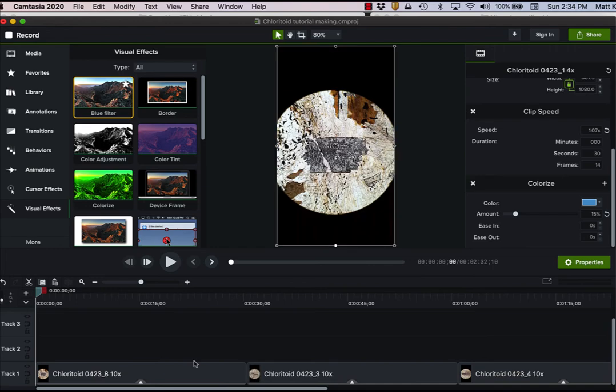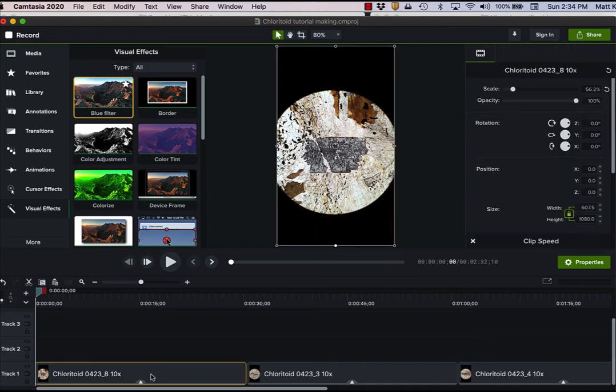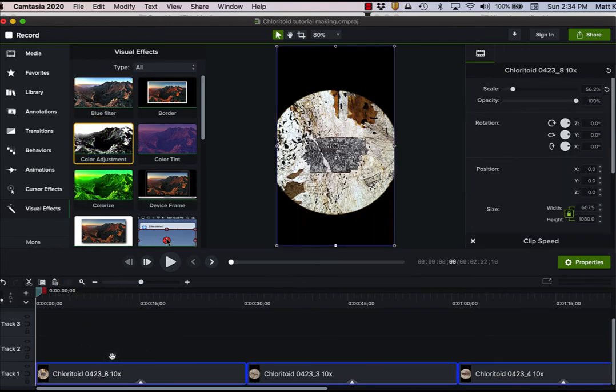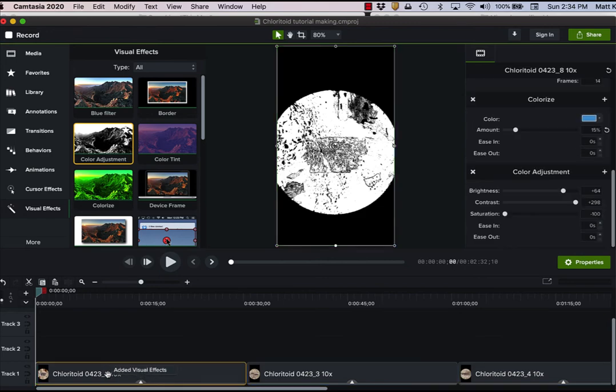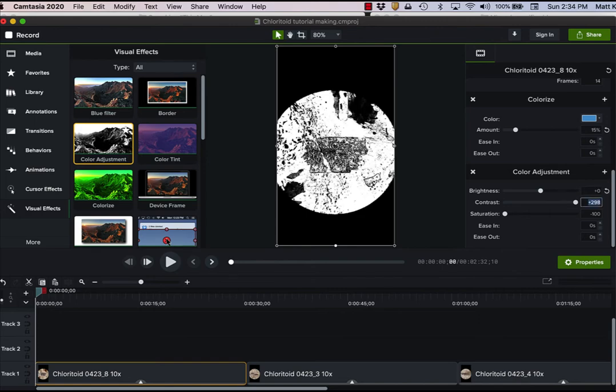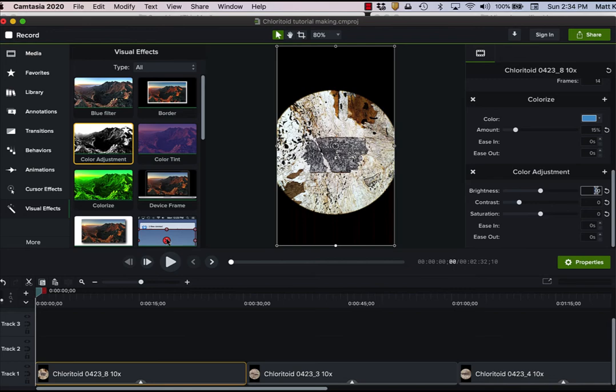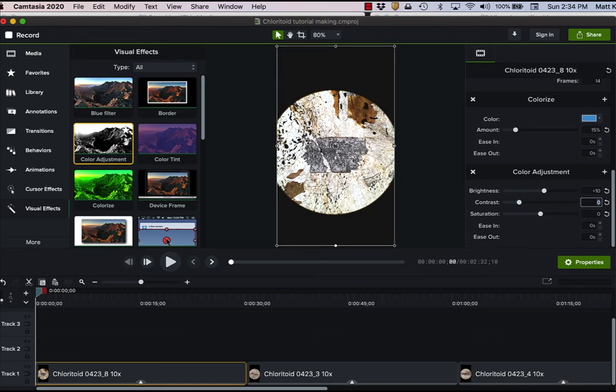And so if I thought this one was too dark, I could grab color adjustment, pull that on there. And now with color adjustment, it automatically has these settings. I have no idea why. This is no color adjustment. And if you want to increase the brightness, then you can just increase it a little bit. If you want to increase the contrast, you can increase the contrast and so on.